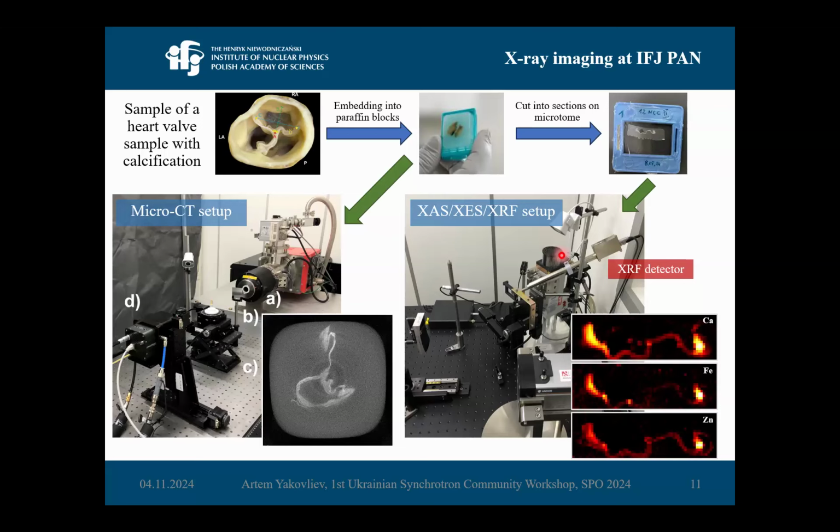And then if you want, for example, higher resolution, higher sensitivity, or you want to do experiments in time with good speed, then you can do them at the synchrotron facility.